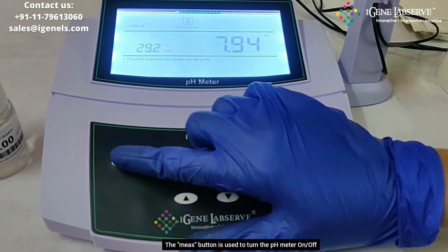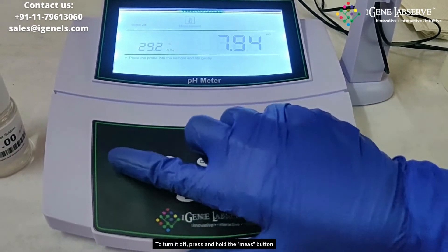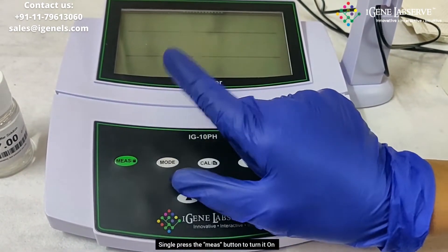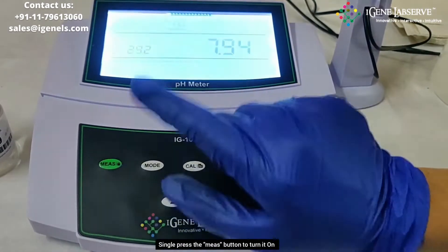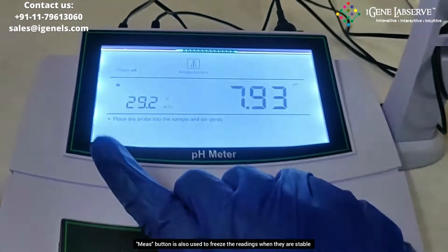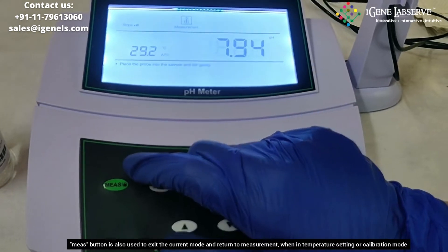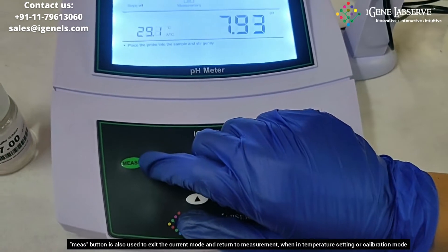The first button, which is the measure button, is used to turn the pH meter off — you have to press and hold the measure button and it turns off. When in the off position, you press the measure button once and it turns on. This button is also used to freeze the readings, and it can also be used to exit the current mode and return to measurement mode when in the temperature setting or calibration.